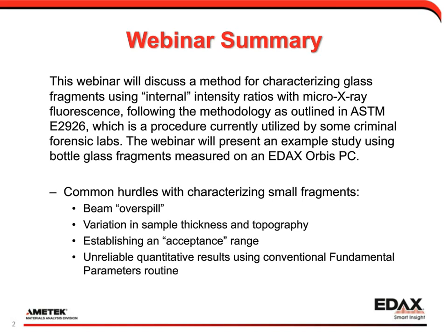So with, of course, the preference to keep these samples intact and minimize any kind of sample preparation, micro-XRF is a technique which lends itself quite well to analyze these samples as is. However, with such a variety of sample dimensions and shapes, as we mentioned, there also comes some hurdles with interpreting the spectral data from these types of samples.